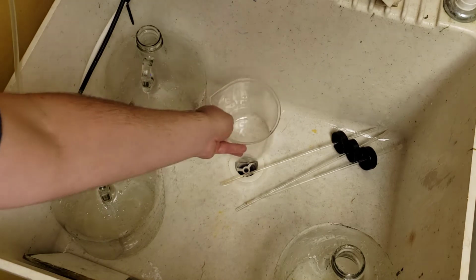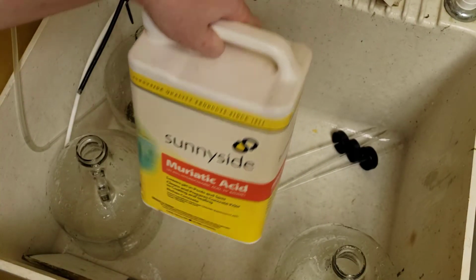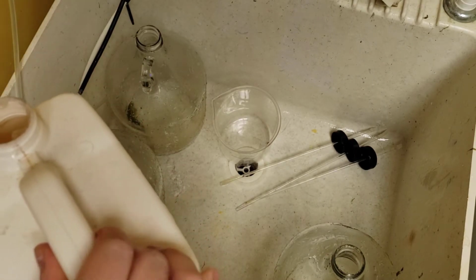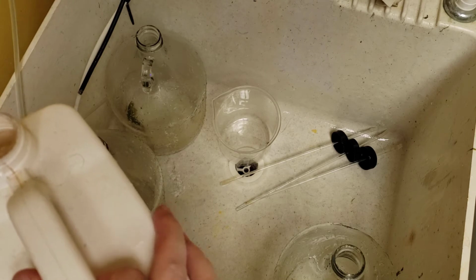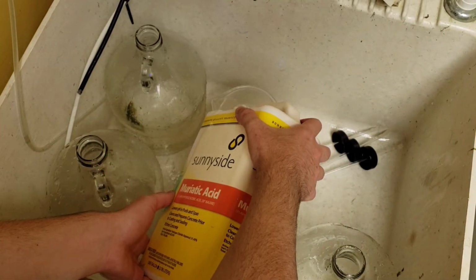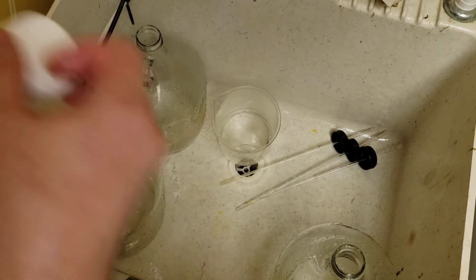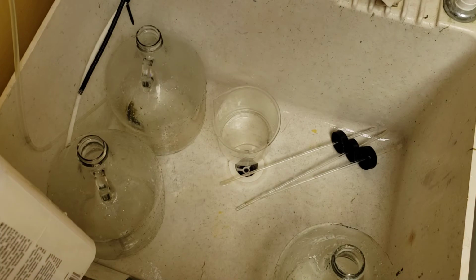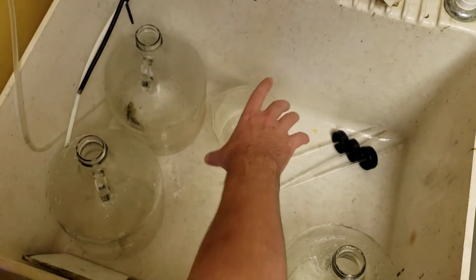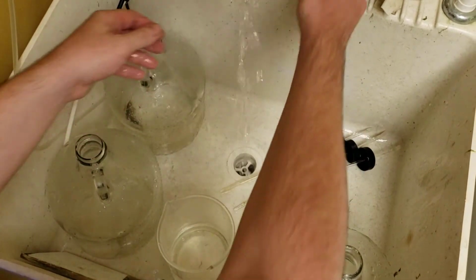So at this stage, we're using the muriatic acid. I get this from the hardware store. This is some pretty nasty stuff. I've got fairly decent airflow in this room to deal with any fumes. Like, I already see, we've got fumes. Don't let this come in contact with your skin.